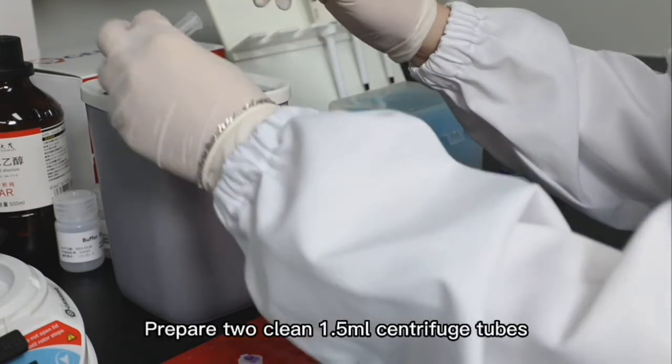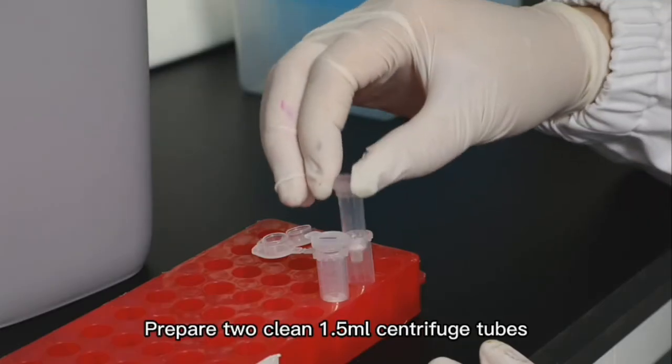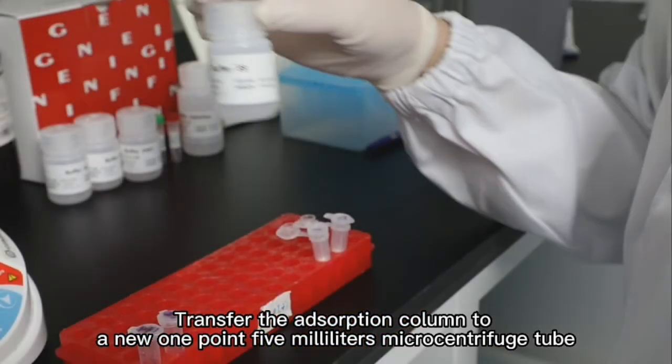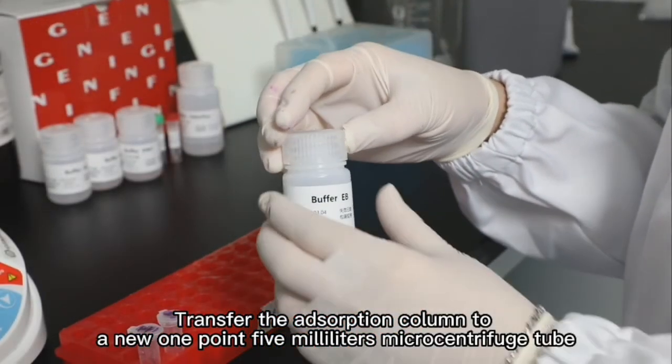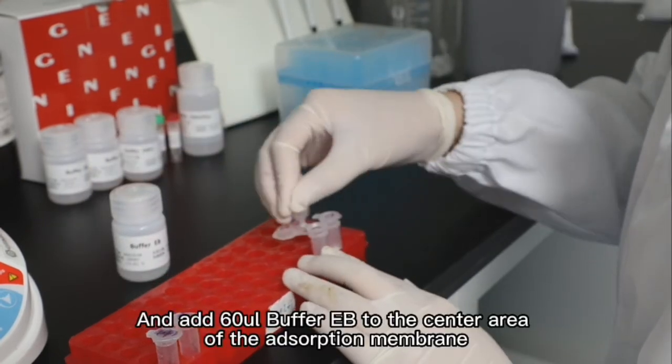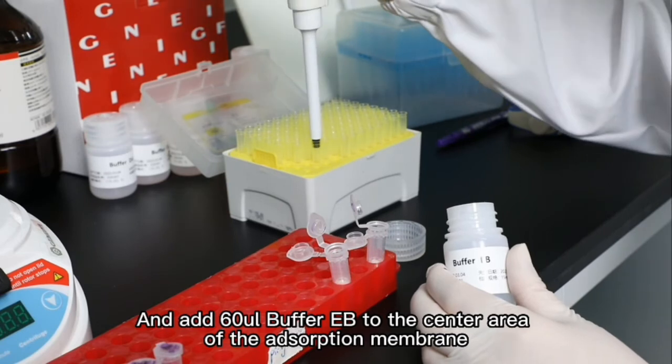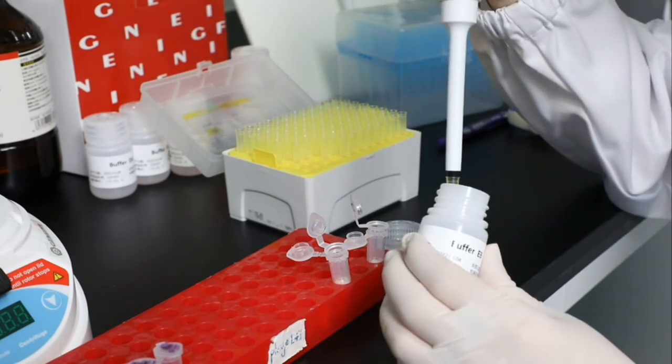Prepare clean 1.5 ml centrifuge tubes. Transfer the adsorption column to a new 1.5 ml microcentrifuge tube and add 60 microliters of buffer EB to the central area of the adsorption membrane.